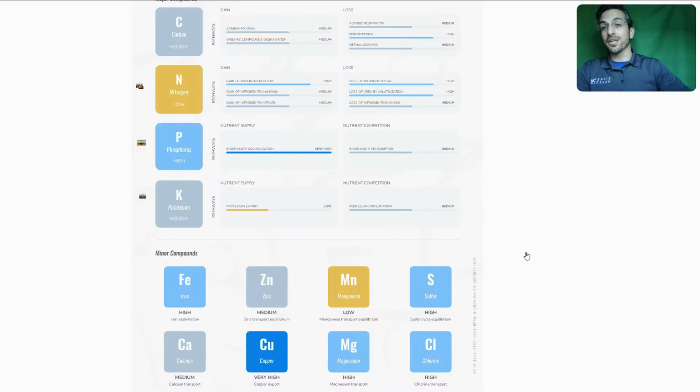Once again, I would like you to skip a page and go to the nutrient cycling section. I think it's wisest to start with the familiar things, such as disease-causing organisms. They're the living organisms in our system that most of us are most familiar with if we're new to testing soil biology. Let's go then to nutrient cyclers. Remember, this is a DNA test. We're looking at living organisms. We can't see the nutrients themselves. These are going to be assessments of the microorganisms that transform nutrients into and out of a form that your crops are able to take up and assimilate.